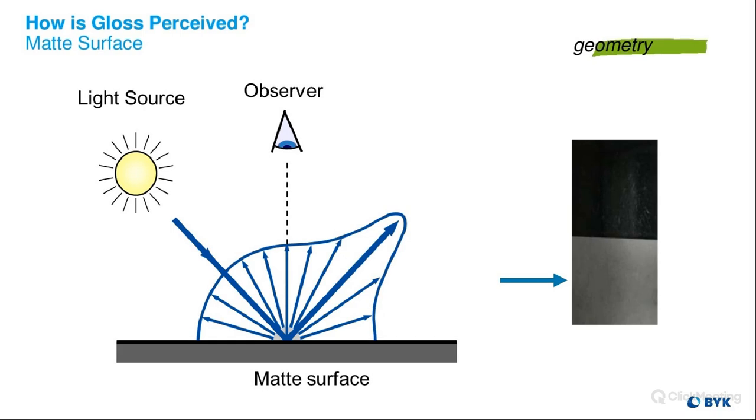And same on a matte surface here. You want to avoid that direct light coming back into your eyes. So you want to observe it from a 0-degree angle. So that light's coming in from a 45-degree angle, and you're going to view it from a 0-degree angle. Now it can also change where the light's coming from above, and you're viewing it from a 45-degree angle. It's called a 0-45 instead of a 45-0, but both are the same thing essentially.